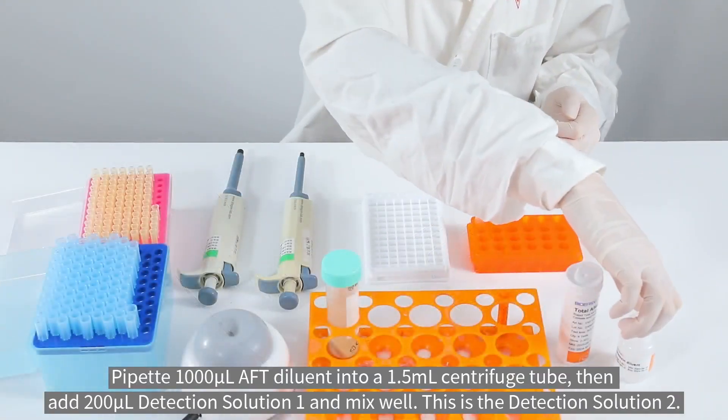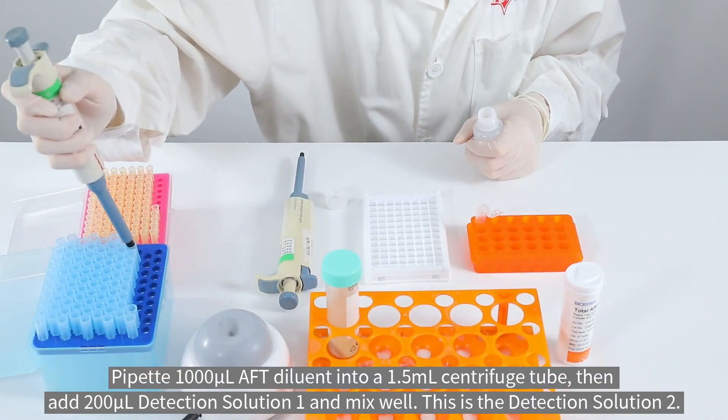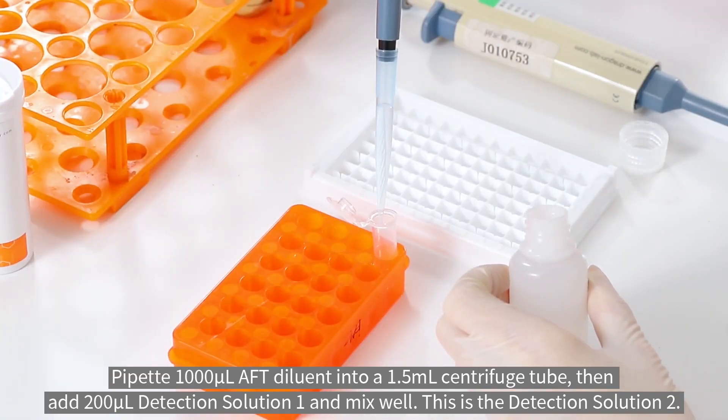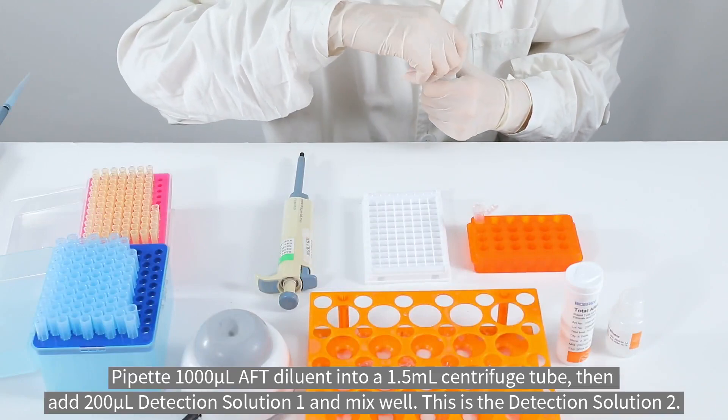Pipette 1000 microliters of AFD diluent into a 1.5 milliliter centrifuge tube, then add 200 microliters of detection solution 1 and mix well. This is detection solution 2.